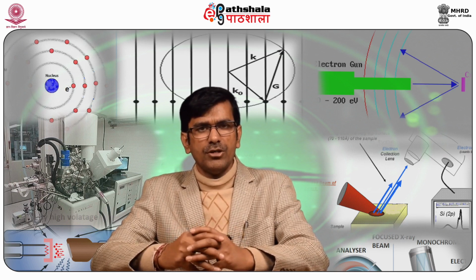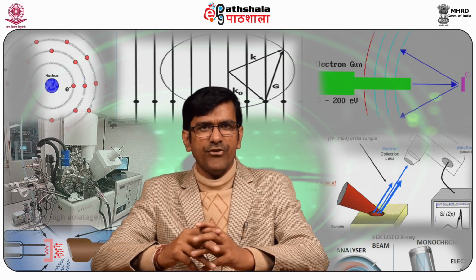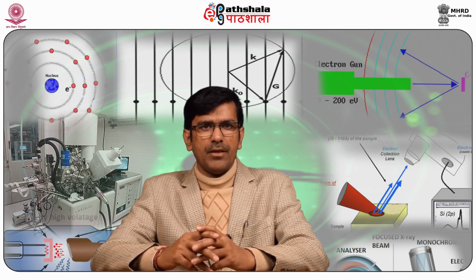Now, about types of splittings, that is spin orbital splitting and multiplet splitting. The first type, spin orbital splitting, is purely an initial state effect which occurs during photoionization if an electron is removed from a degenerate subshell. Another type of splitting is multiplet splitting, which arises when there is an interaction between unpaired electrons formed by the photoelectron ejected and already pre-existing unpaired electrons.